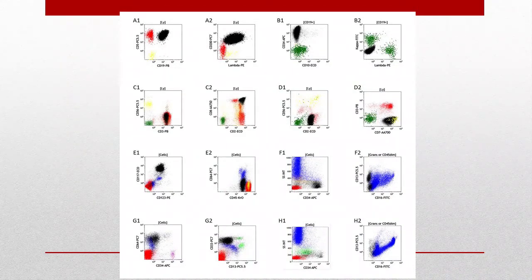And the very final one here is actually a myeloma patient that has a large increase in plasma cells that are bright CD38. But that's actually not shown here.